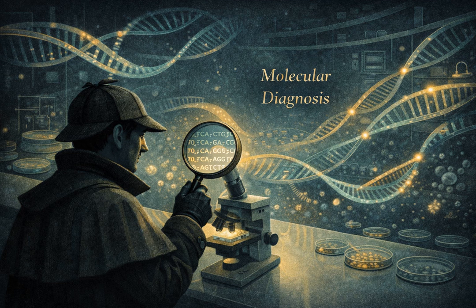That's a perfect way to put it. Now, for the exams, it's not enough to just know standard PCR. That's table stakes. We need to talk about the different variations, the different flavors of PCR. Right. These are the high-yield differentiators. First up, and maybe the most important variation, is RT-PCR. Which stands for reverse transcriptase PCR. This is critical to understand.